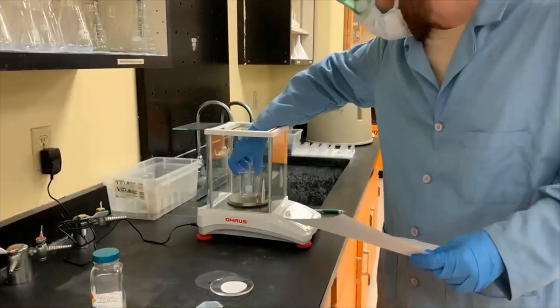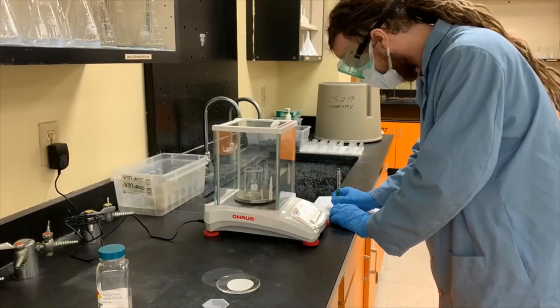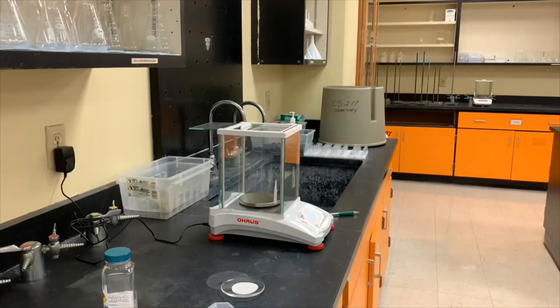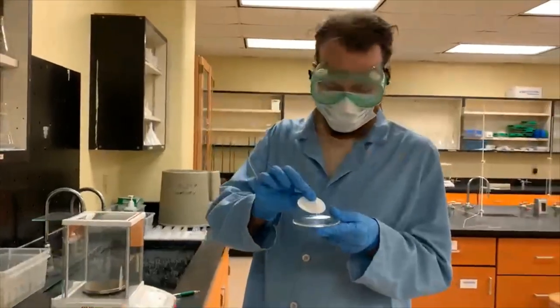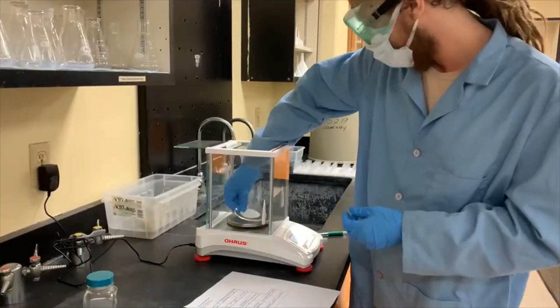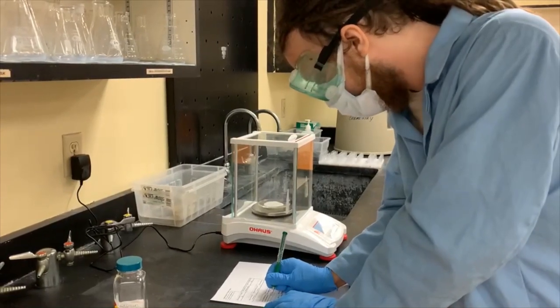And then we're gonna check the mass of beaker two. And for beaker two, we get 49.389 grams. And we can weigh the watch glass and the filter paper together, because when we'll be taking the weight of the sand on the watch glass and filter paper later, we will be weighing them together basically. And for the watch glass and filter paper, we get 47.034 grams.